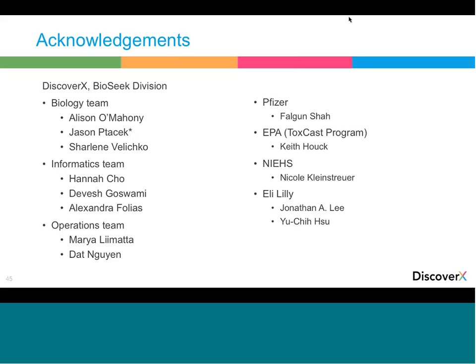Okay, a question on how we handle genetic differences, or genetics. So this platform we've developed for screening includes, in the Diversity Plus panel, cells that are from pooled donors. And so we are taking an average of the response. What we are looking for are those mechanisms that would be important to many people and be population-based. The other way to spin this platform, which we've done in custom projects, would be to look at individuals separately, and that's a very interesting project to do, and we've done some of that work. One can even start to look at genetic differences between donors and that sort of work too.